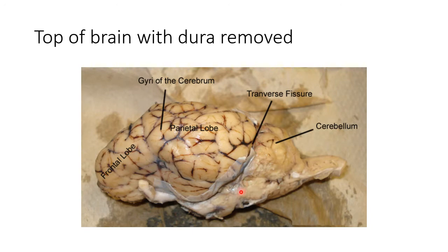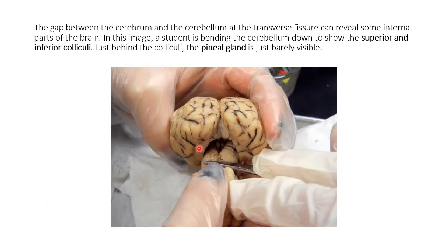See this transverse fissure. Someone has pointed this straight at them and then bent the cerebellum down. You can see this little section — it's got four little parts, really looks like two bumps with a little bump on top. Collectively this is called the corpora quadrigemina. This is the inferior colliculus — left and right side — and this is the superior colliculus — right and left side. They have to do with processing sound and sight. Up in here you can barely see the pineal gland, which makes melatonin.